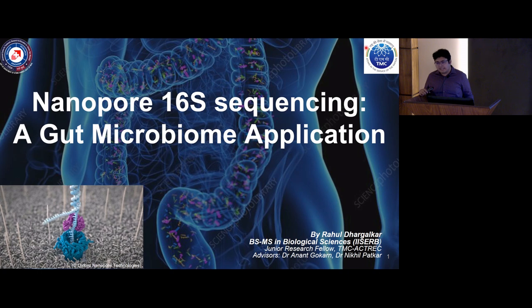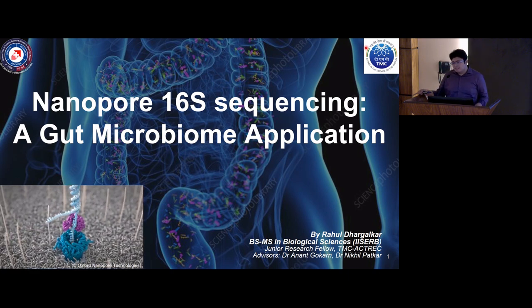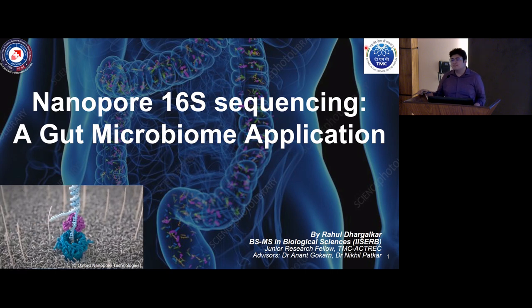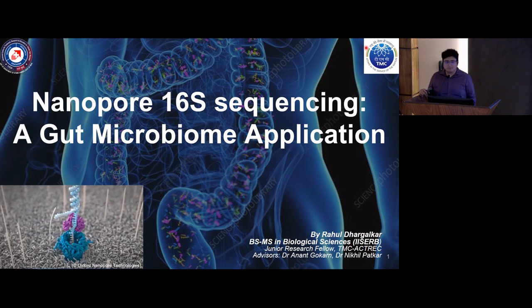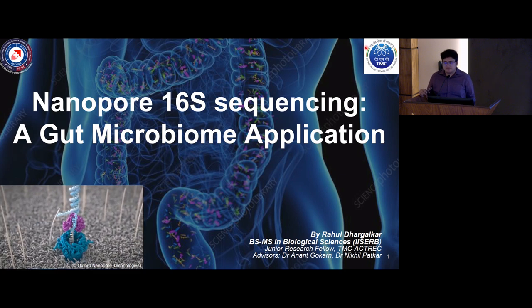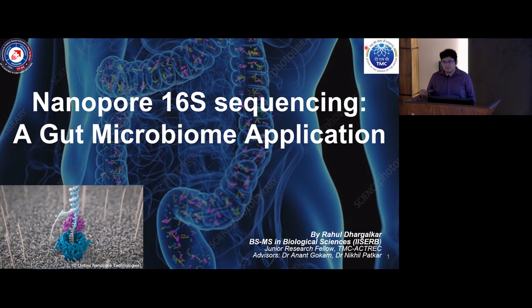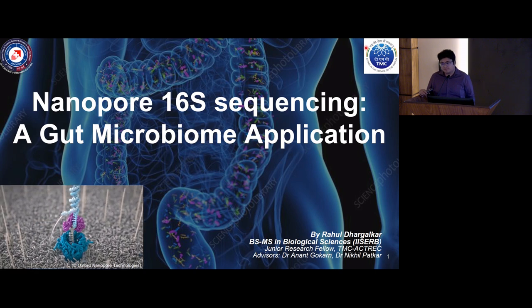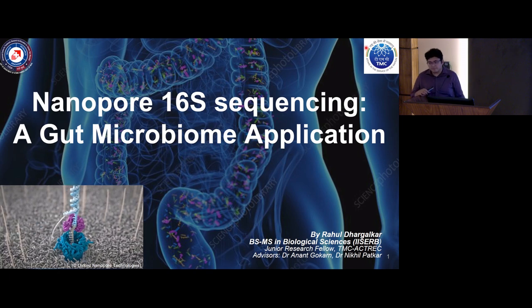That is R10, so that is compatible with all systems, not only PromethION. Yeah. The main problem that we are seeing is that the Flongle has a lot of quality issues even now. So it's not reliable, but MinION is more stable. The quality drops fast. Still, they haven't ironed out a few of the chinks there. But Flongle is phenomenally cheap. It's 7,500 for one flow cell. You can put 2 samples in there, and you don't need a lot of upfront investment.